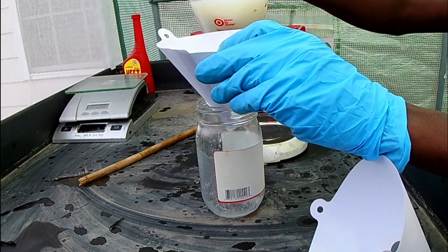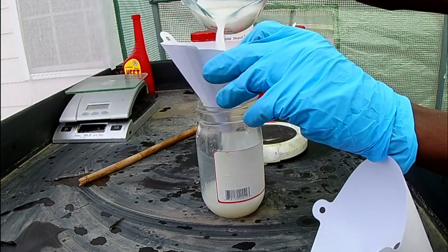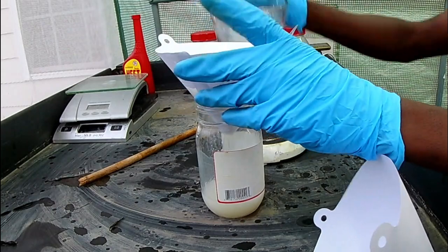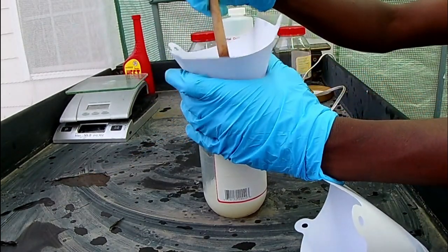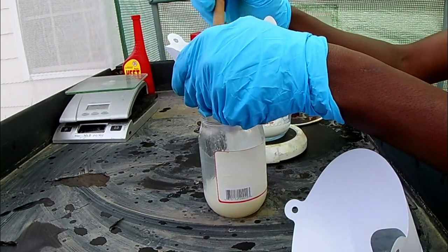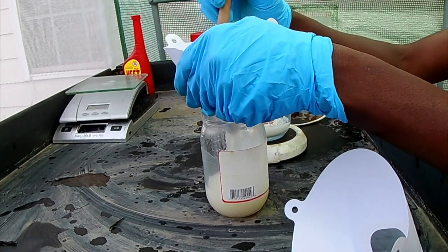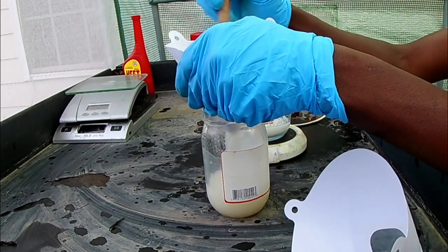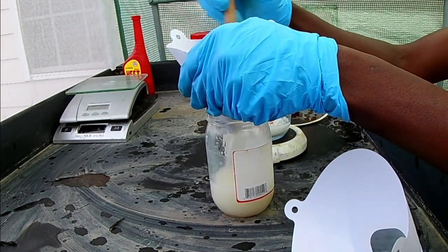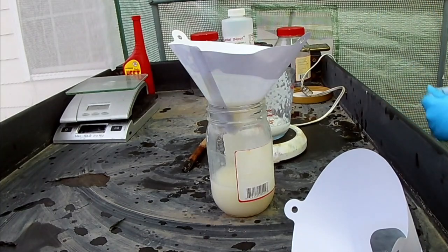At this point we're going to pour this into the container through a strainer, just to strain out any pieces of wood or big crystals still in there. You can see how much sodium hydroxide was left over after I sat there stirring for 20 minutes. This is my first time doing it, so maybe I did something wrong, but that stuff was not going through no matter what I did. I'm just making do with the situation — it's already alkaline, it's already white and cloudy, and we know some of it dissolved. I need a magnetic stirrer before you catch me doing this again.